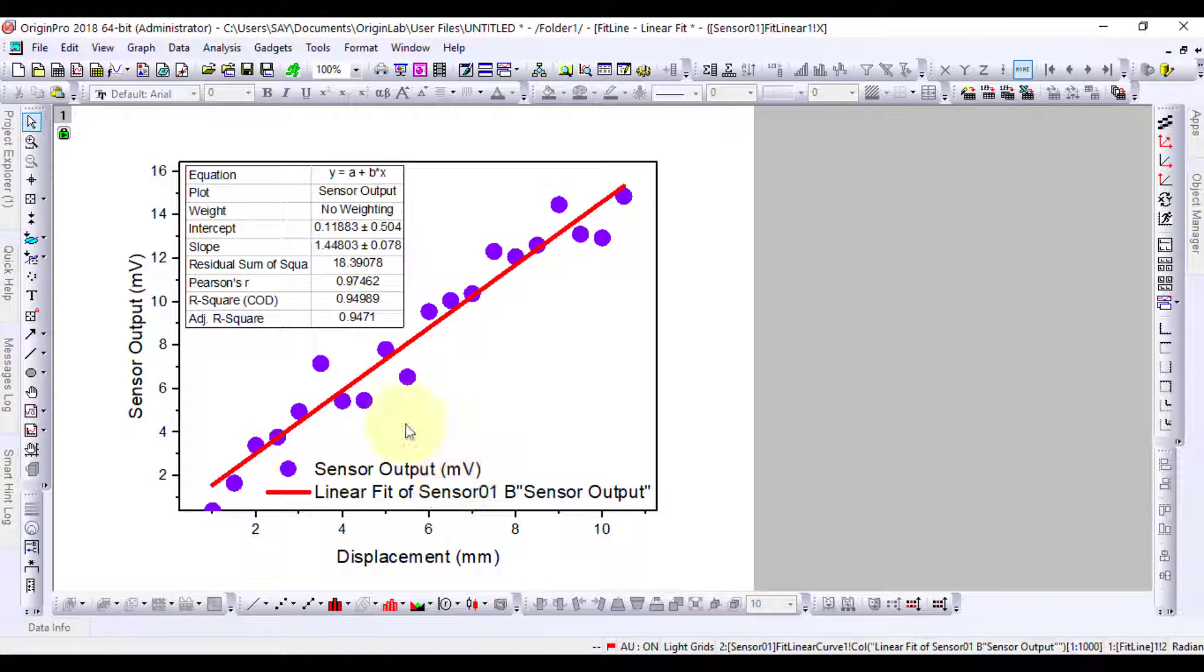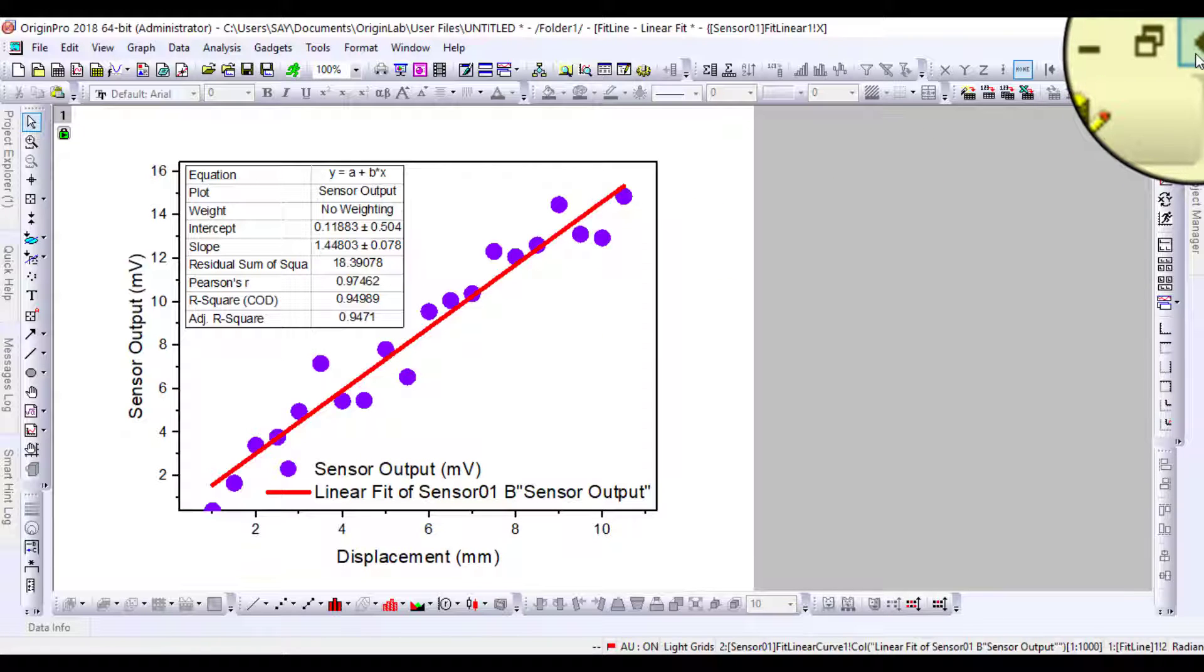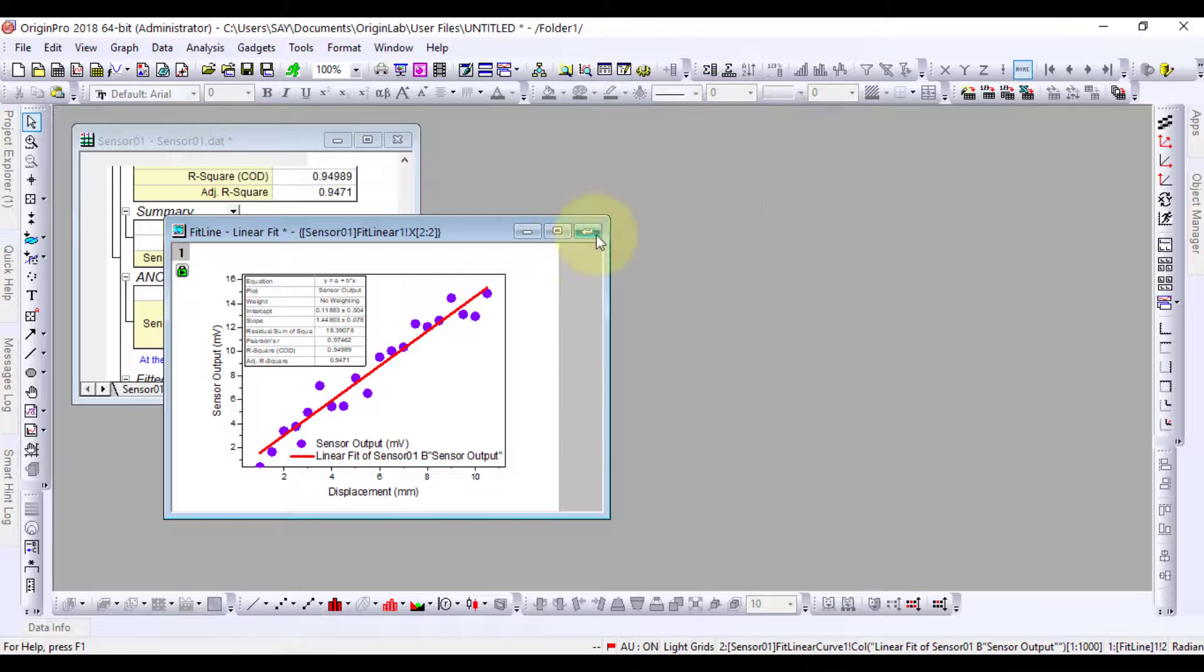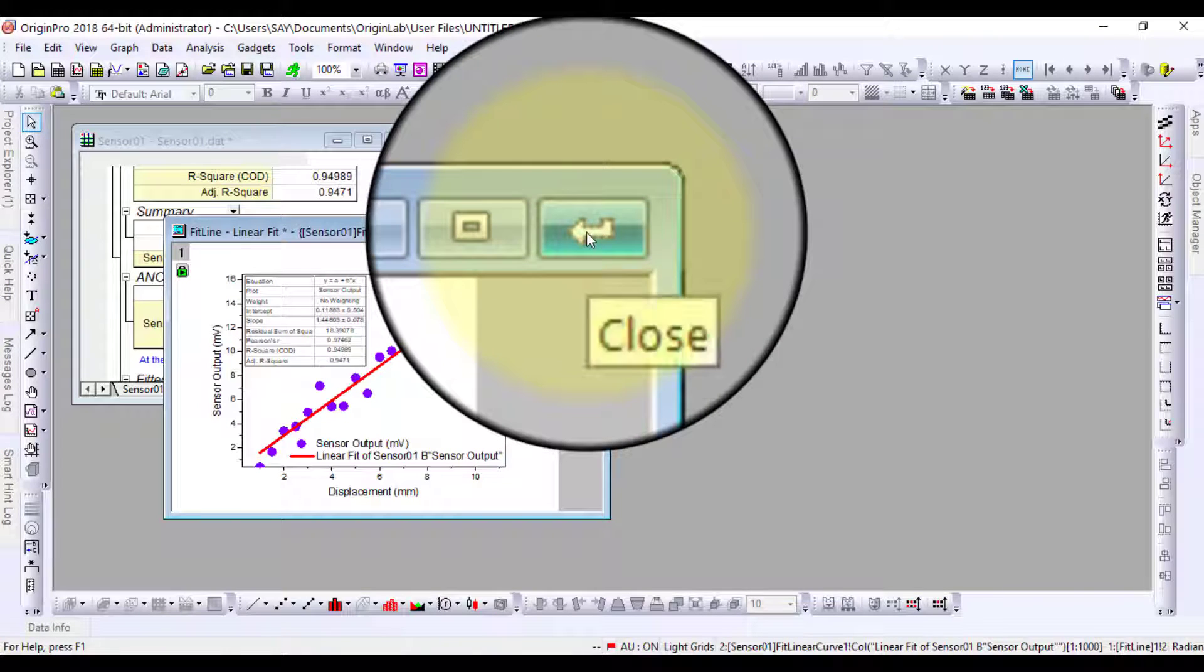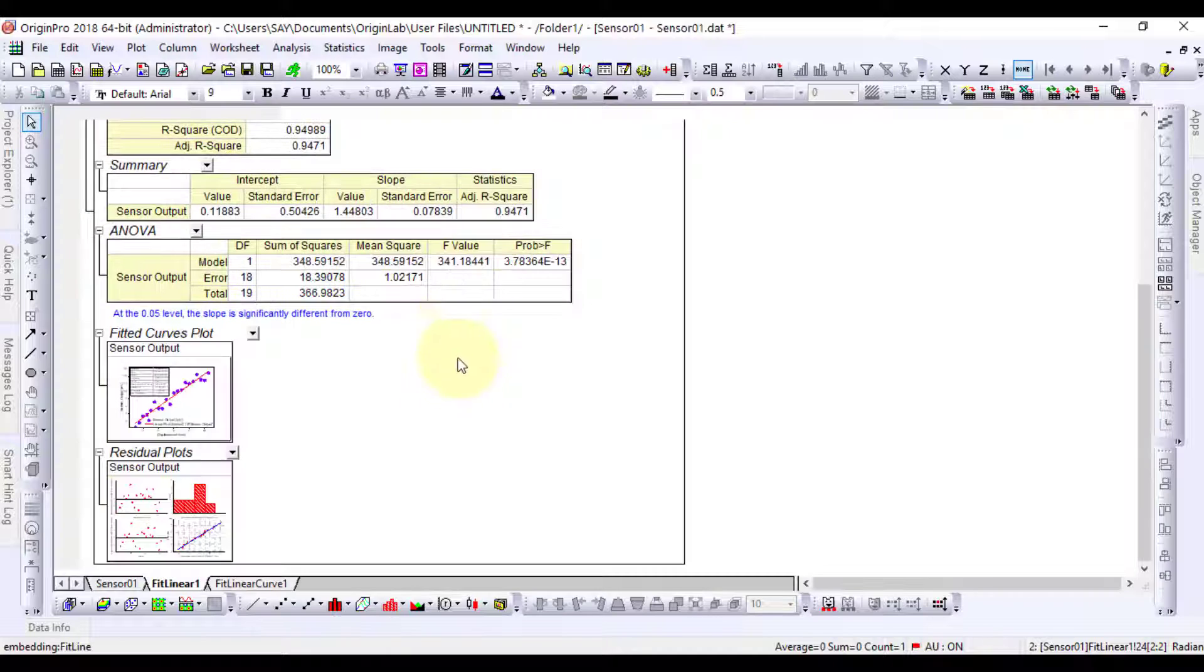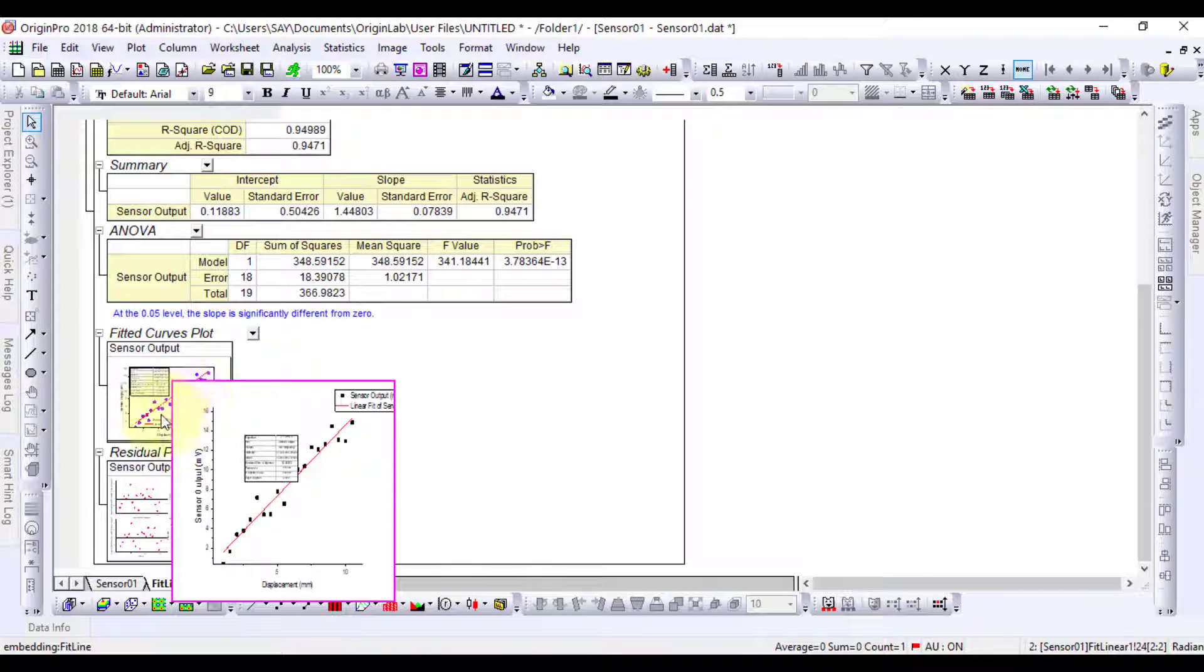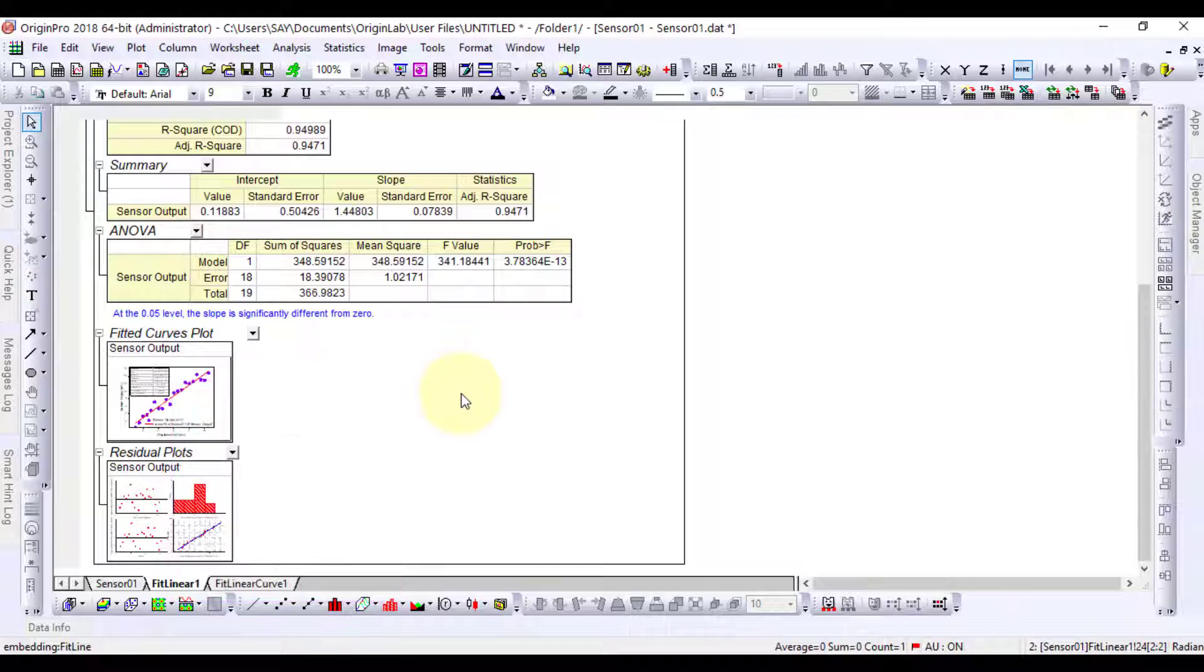Now, to restore the figure to its original location, we will click here. We can zoom in to view our modified figure here.